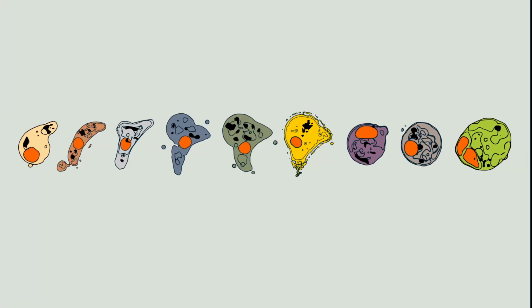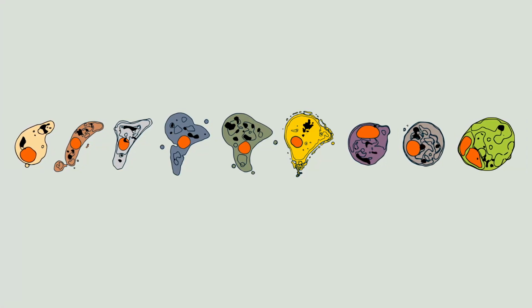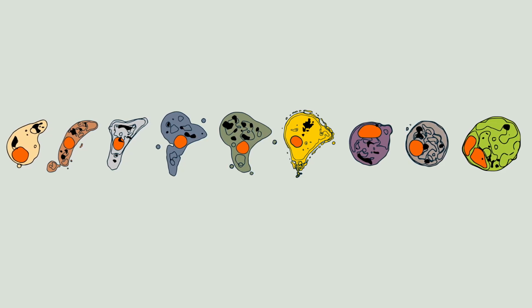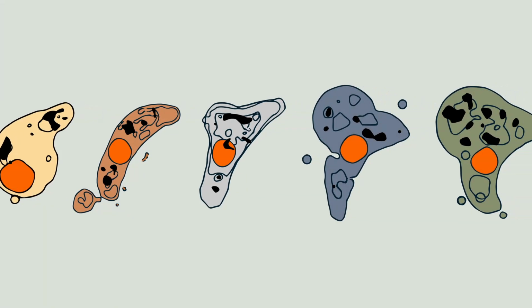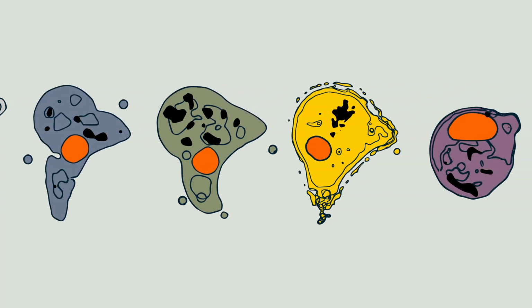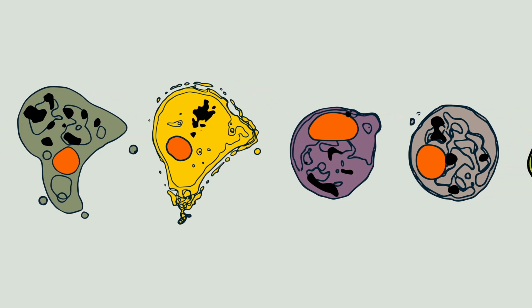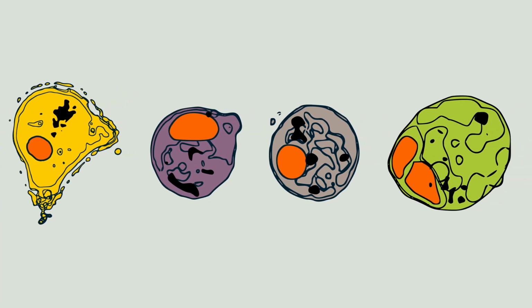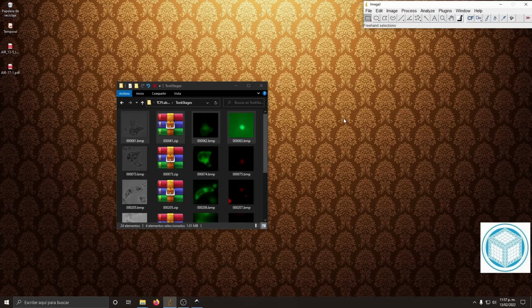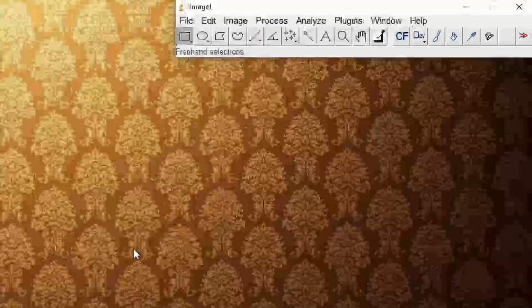As you see, what I want to do for my logo and banner is to make simplified images of the differentiation stages, highlighting some characteristics of the parasite. I want them to look membranous and to clearly show the nucleus, which makes them look actually like cells and not just nodules. Then I want to represent the malaria pigment, these black spots, which are a specific characteristic of these kinds of parasites. To achieve all this, I'm going to use ImageJ.